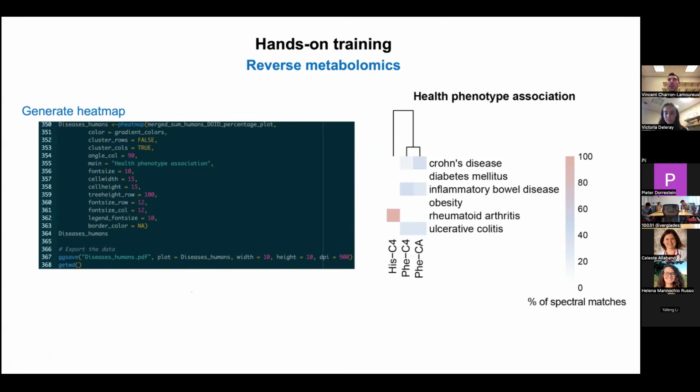Yeah, this is nice. We were wondering whether the features in these disease data sets have already been filtered for significance, or is this plot just saying these are the data sets where you can find them? Yeah, exactly. So this just shows you association. This doesn't do the statistics, you need to do that afterwards. It's part of the validation part.